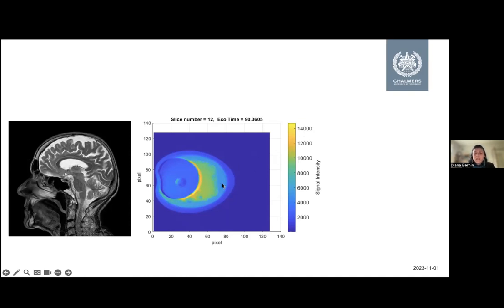And that's really important to understand when you have an image: if we want to see some things, we have to have a contrast. Otherwise, the image would be completely blue. And I will tell you in a couple of minutes what gives you a contrast in an image, and in particular in an MRI image.